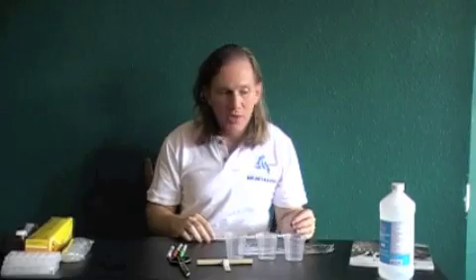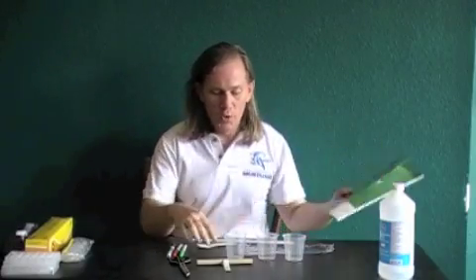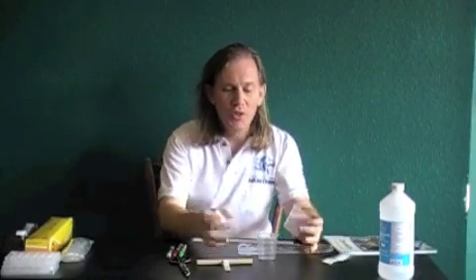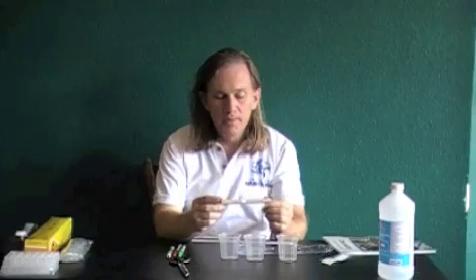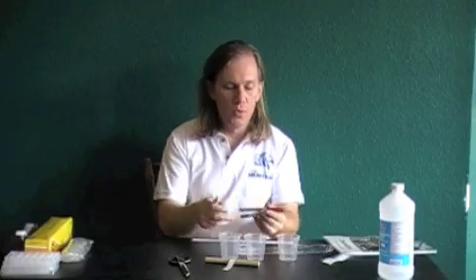For this lab, you're going to need your lab guide, filter paper from your kit — it's labeled so you should be able to find it — three 100 milliliter beakers, your dowel rod, and black, red, and green permanent markers.